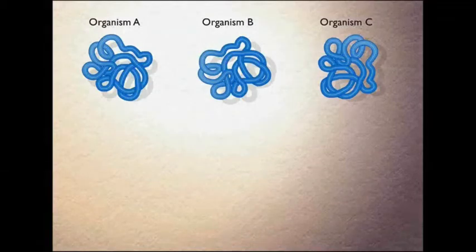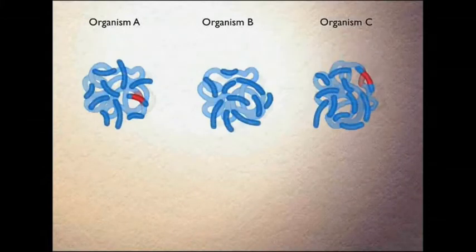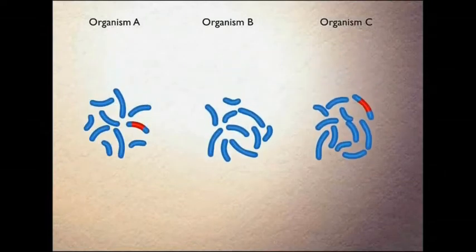Southern blot is used to verify the presence or absence of a specific nucleotide sequence in DNA from different sources, and to identify the size of the restriction fragments that contain the sequence. In this process, the DNA is isolated from each source and digested by a specific restriction enzyme.